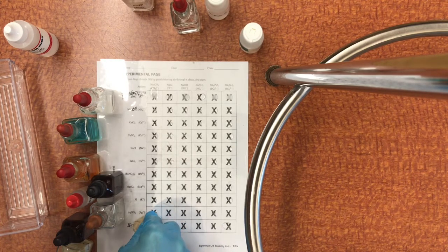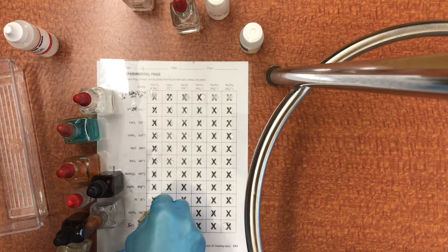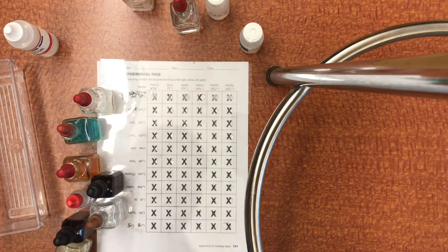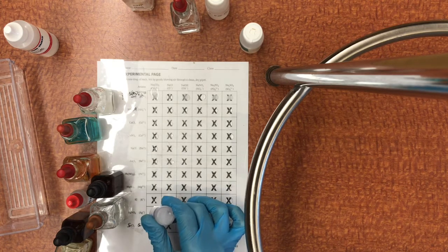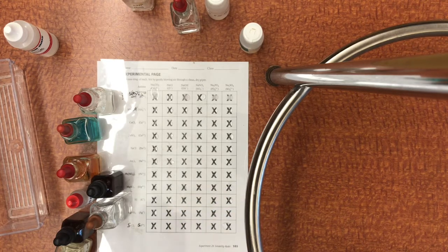Unfortunately, if the paper is not absolutely dry, you can't get the next drop to sit nicely. All right, let's try it one more time. I'm sure this is very thrilling. There we go. Nice drops. Okay.